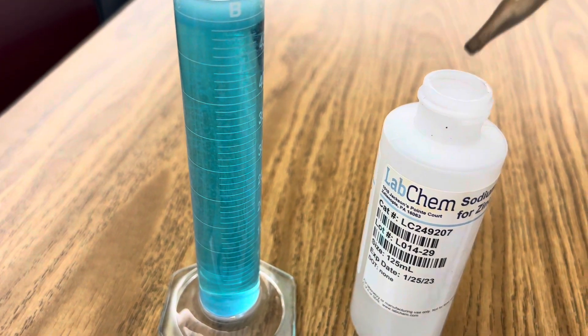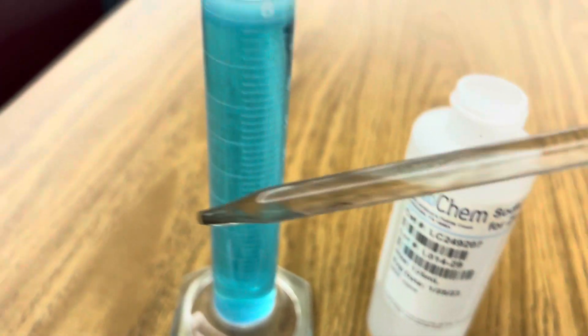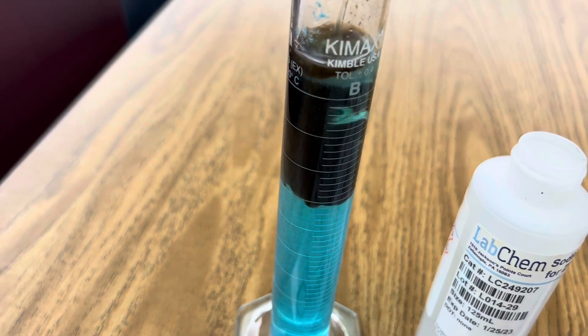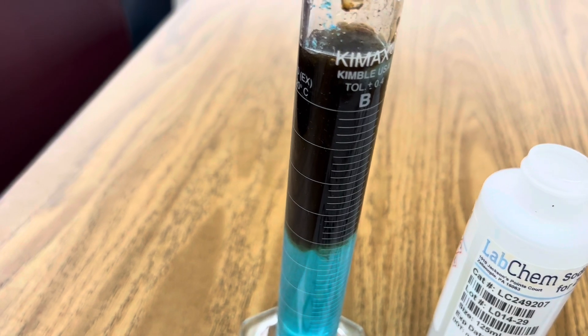So this is what my sodium sulfide looks like in the dropper. You can see it's clear, but when I add it to my solution of copper sulfate, you'll immediately see this dark precipitant fall out of the solution. And that's copper sulfide.